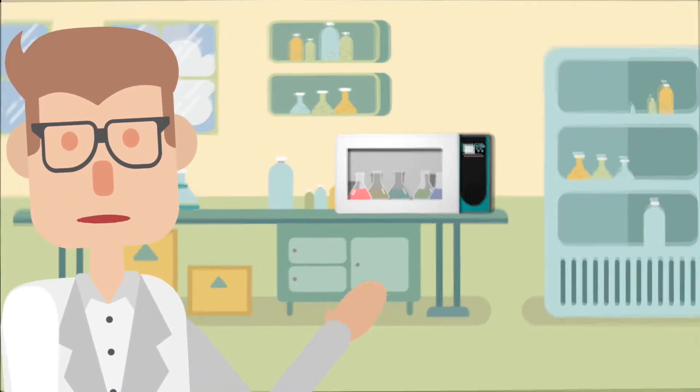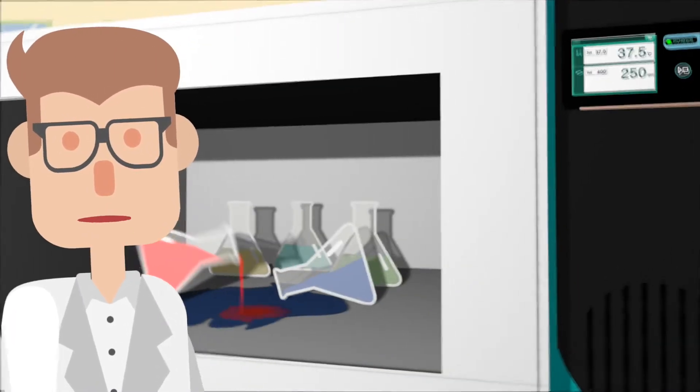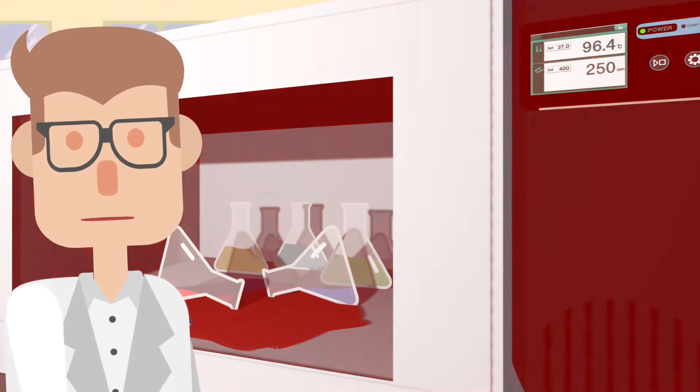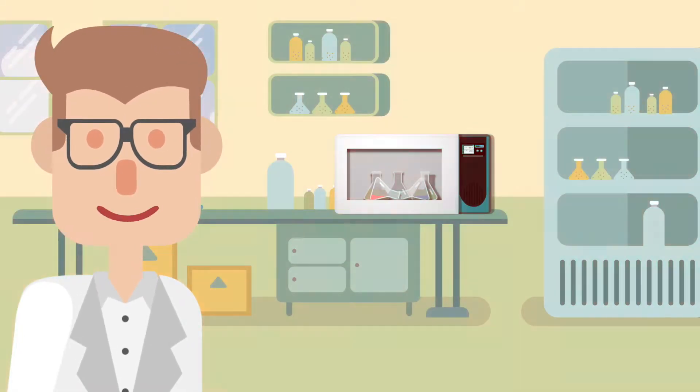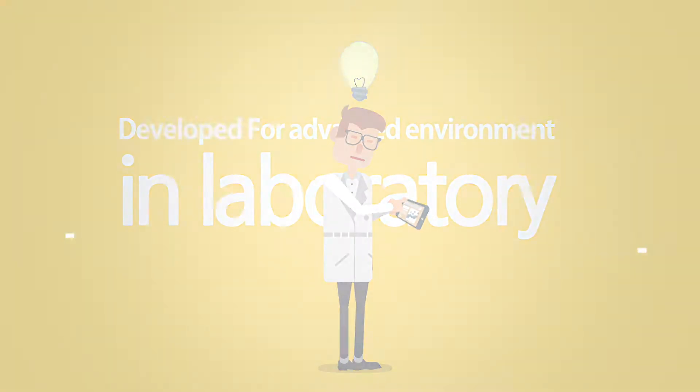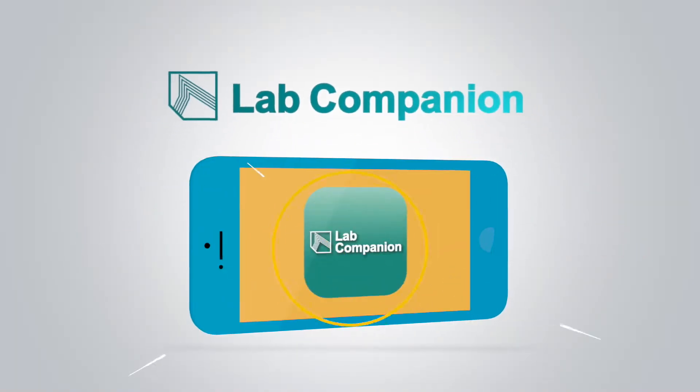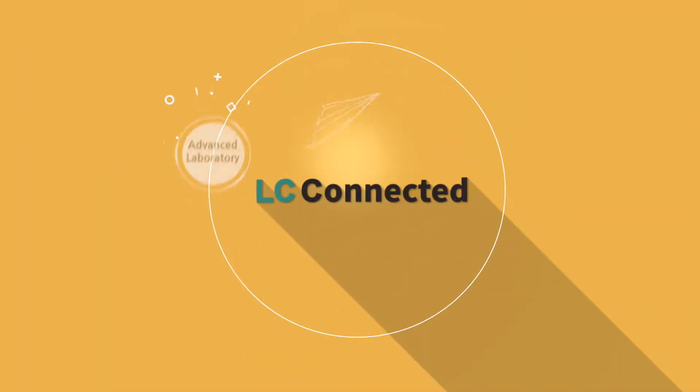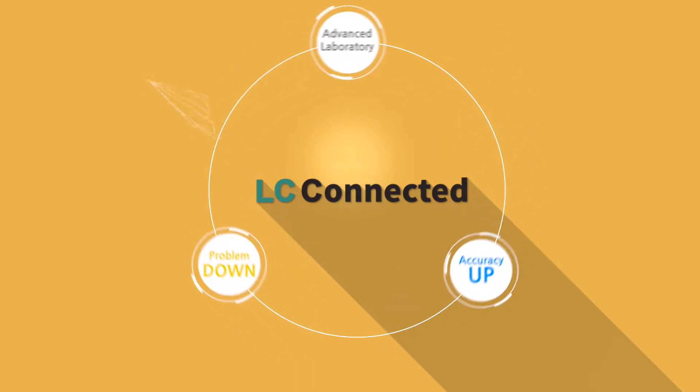The days are gone when you can only discover problems when things go way wrong. Now with the new LC connected, the IoT-enabled lab companion device, you can maximize the reliability of every experiment with pre-formulated setups, while minimizing the downtime and malfunction.